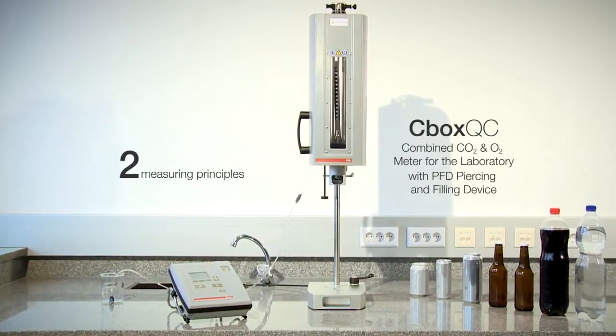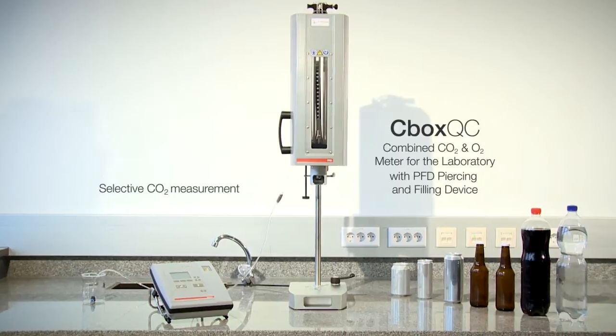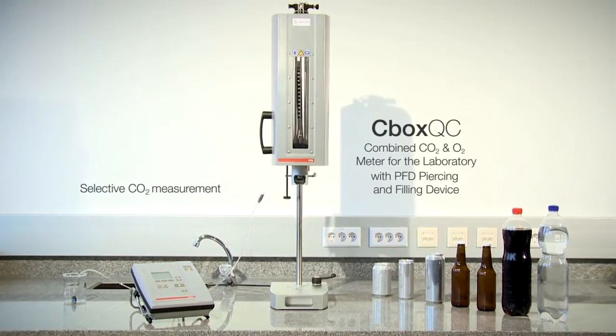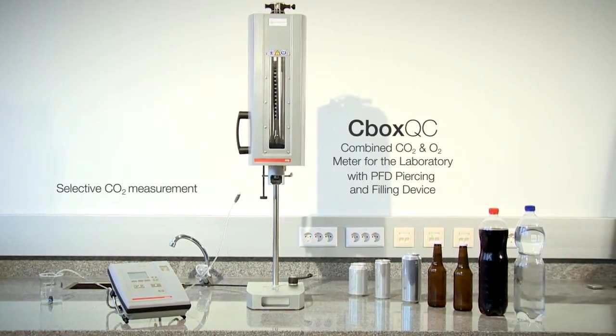Seabox QC employs the combination of two measuring principles. Based on the patented multiple volume expansion method, the analyzer selectively measures carbon dioxide, uninfluenced by any other dissolved gases such as air or nitrogen.